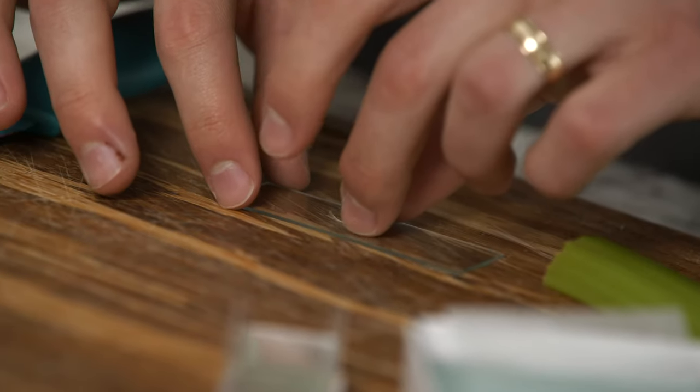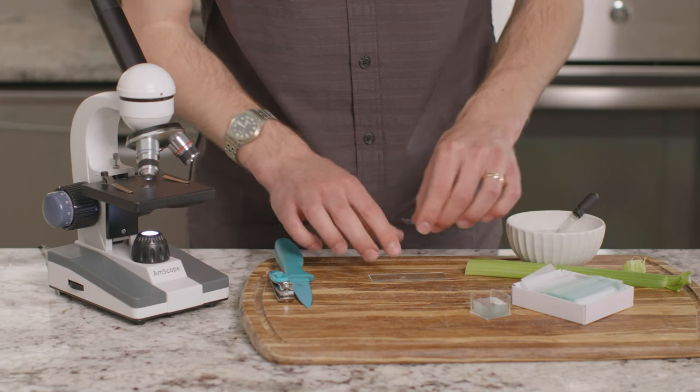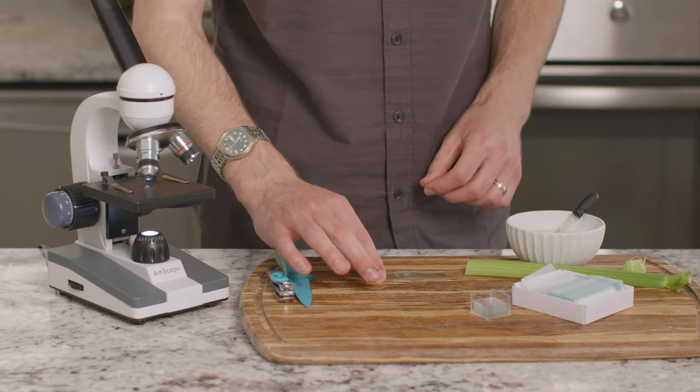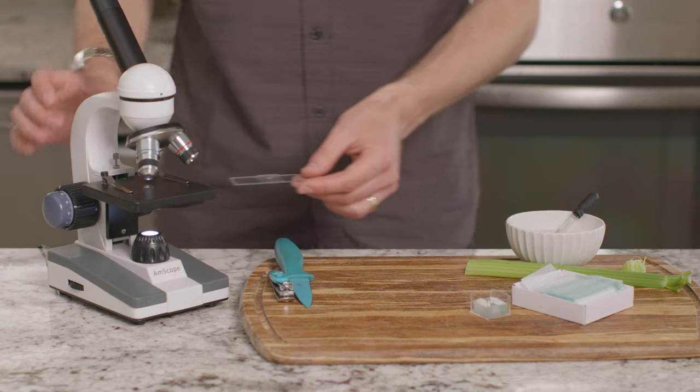I'll put that on the glass slide. I don't need distilled water for this specimen, so I'll just cover it with a slide cover. Alright, let's view it under the microscope.